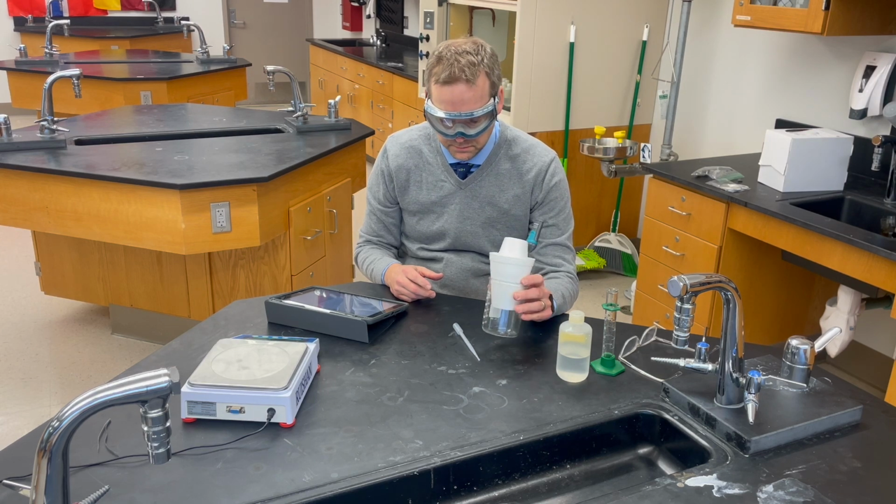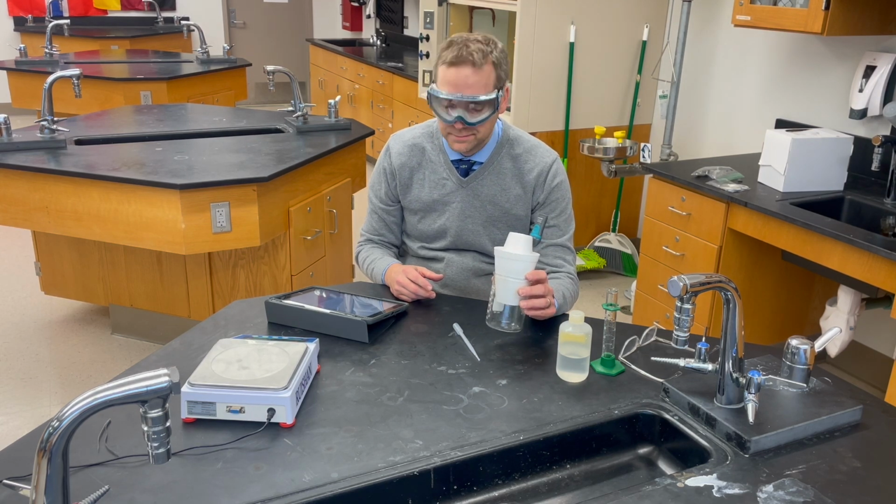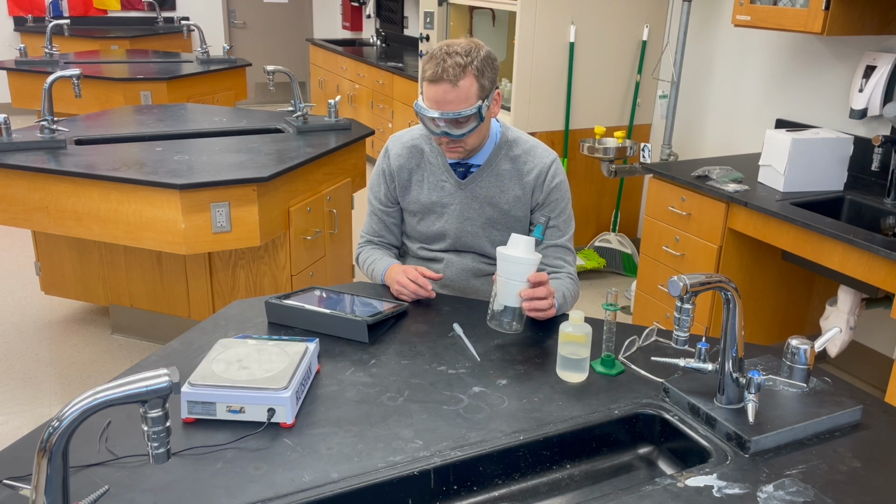I'm going to speed this up a little bit because this process takes about 2 or 3 minutes to fully react.